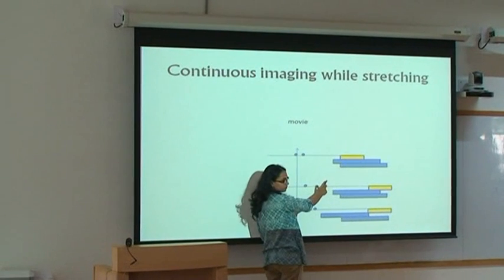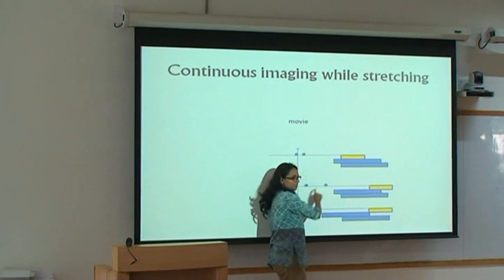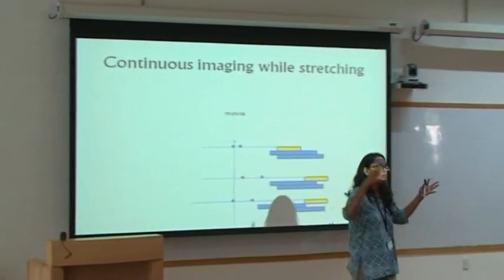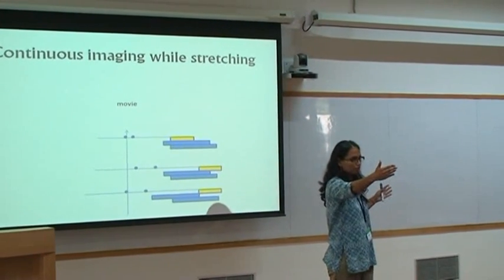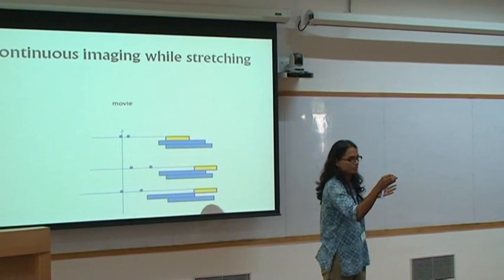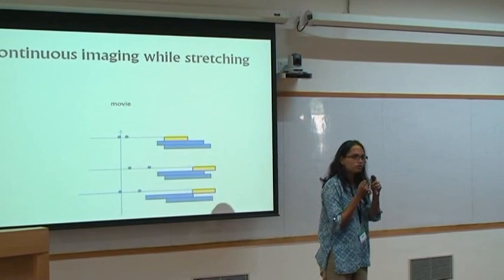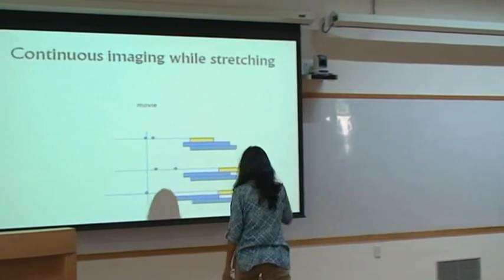Let's say at one time point it's here. When you stretch, this moves, that moves. This is just done hand-wavingly. The stretcher will move, that's why this and that move. So it has moved from your visualization. If you're looking at bigger areas, you have bigger strains. Even 10% strain on 1 centimeter gives you 1 millimeter movement. So something which was almost at the center might move 0.5 mm. Okay, 0.5 mm is a lot for your field of view. The field of view is 100 micron, not more than that. So while you're doing the stretching, you have to keep bringing it back to the center.